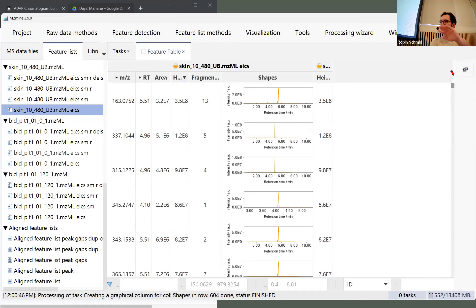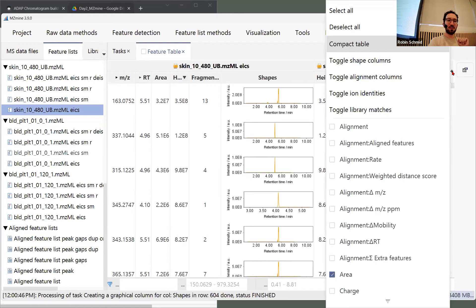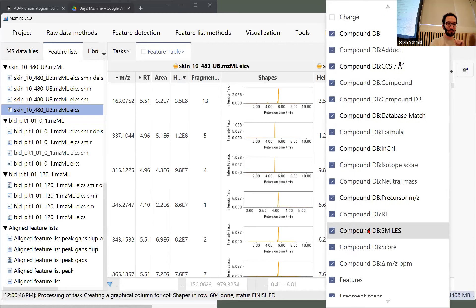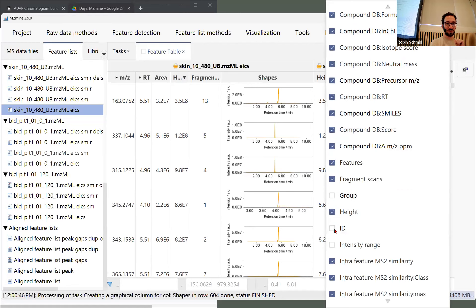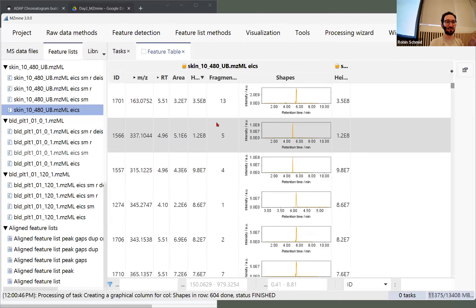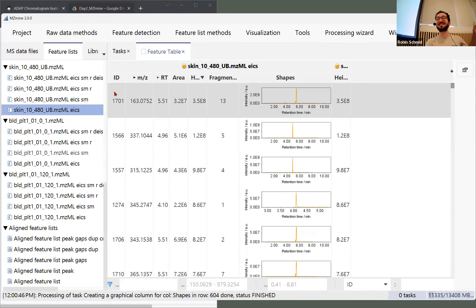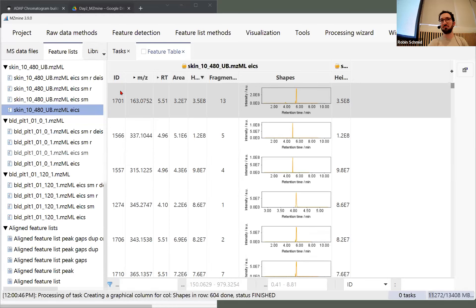On the left side there's the retention time column. I somehow dropped the ID column — if that's also the case for you, you can click the plus button here and add the ID column by scrolling down and selecting ID. The same is true for m/z and so on. The ID is the feature ID, like the row ID, and we're going to use that for aligning different tools later on — we export everything with the ID.